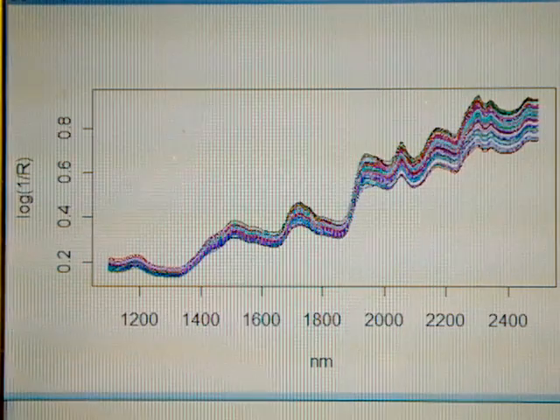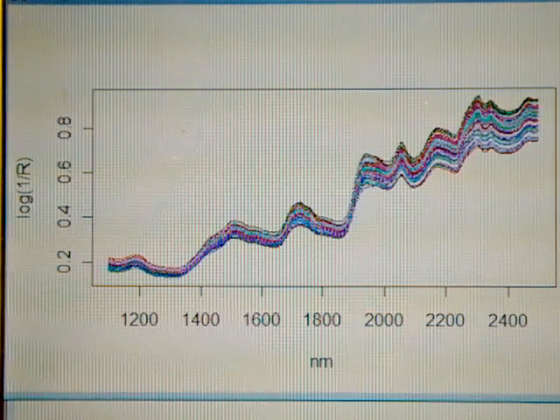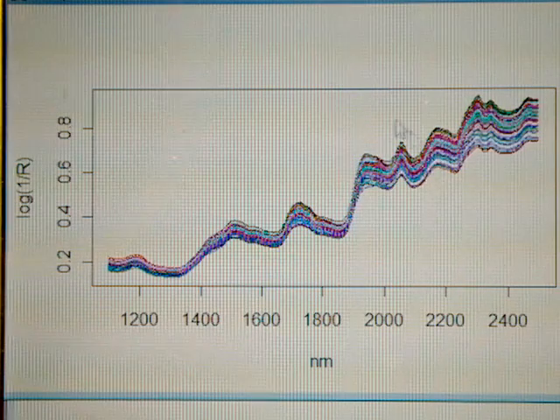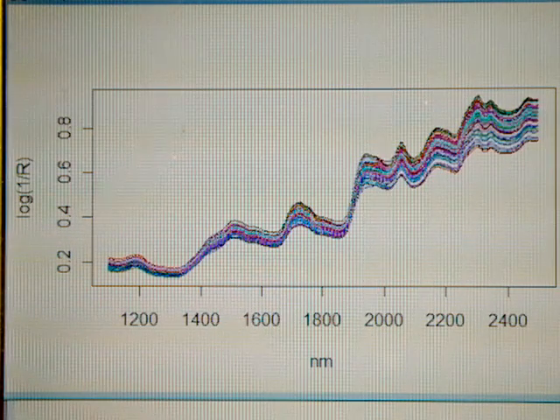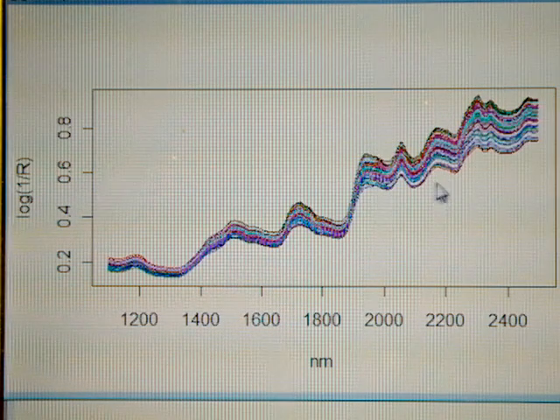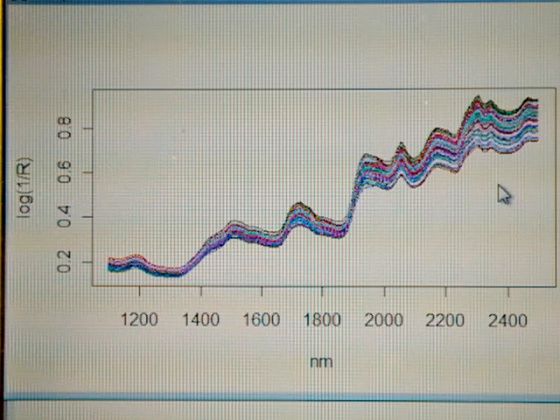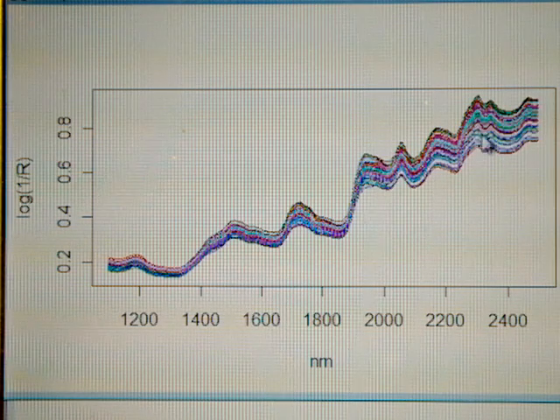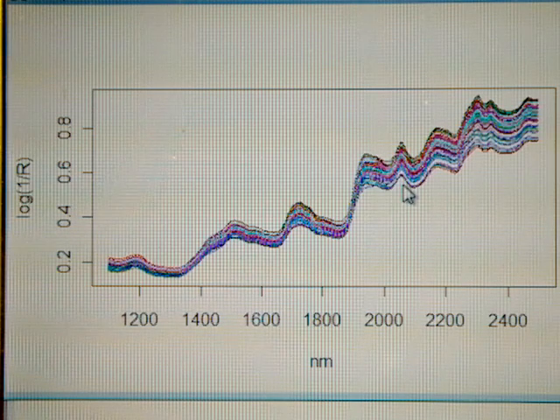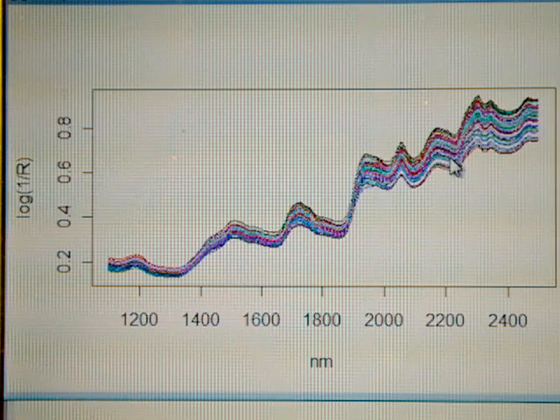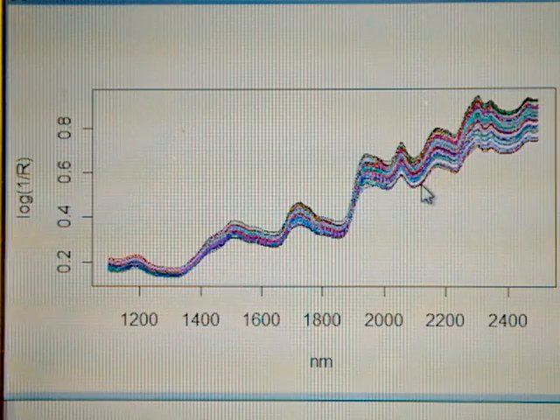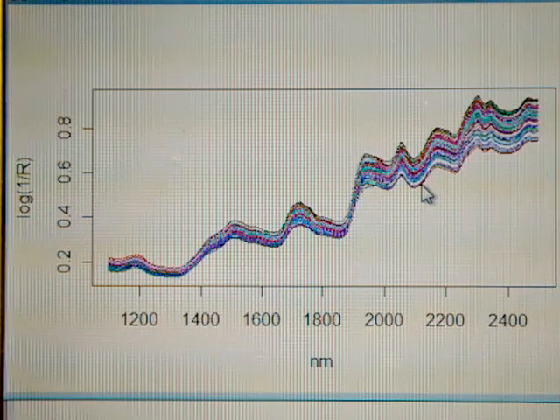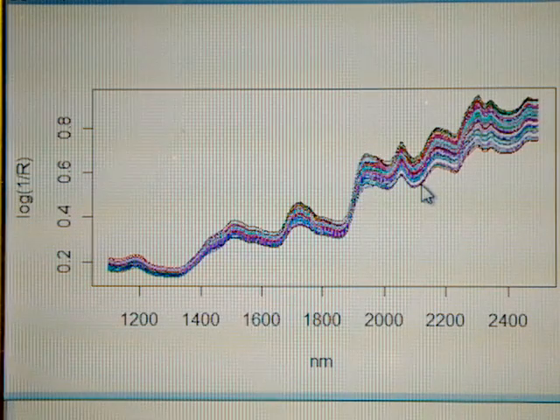We have seen in the previous video the spectra of the demo data from 1100 to 2500 nanometers. But if we look in more detail, we see a big separation between the spectra. This is due not to chemical reasons, just to physical reasons, to the scattered effect that is typical in the diffuse reflectance instruments.